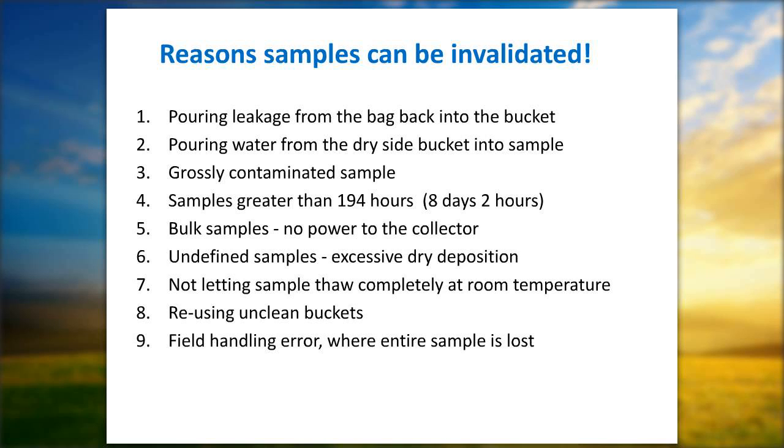The only exception I'd say to that is if you can fit the entire sample, if there's just a few chunks of ice and you can pour it all in your 1 liter bottle, that's fine. But we always advise it's best to let it thaw completely, and certainly don't be in a hurry. Don't just let it thaw enough to pour out into the bottle. If you have to, we advise letting it sit out at room temperature, or ideally in a cool place above freezing. You want to make a note on that, Jeffrey?